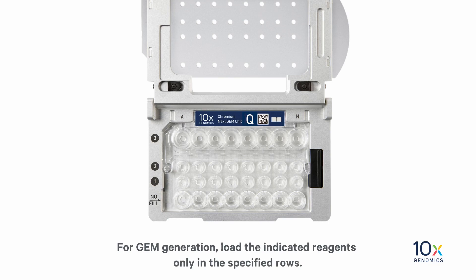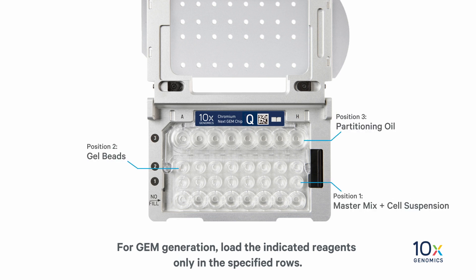We are ready to load the chip for GEM generation. Load the indicated reagents only in the specified rows, starting from the row labeled 1, followed by rows labeled 2 and 3. Do not load reagents in the bottom row labeled 'No Fill.'